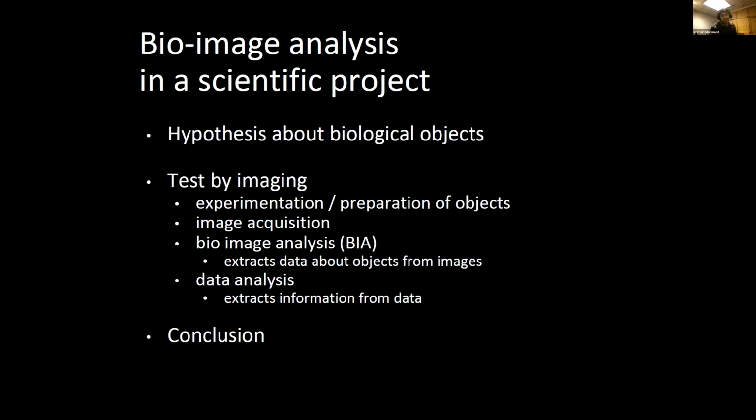Why do we care about reproducibility? First, let's look at what could be a timeline for a bioimage analysis project. You have some hypothesis you want to test about some biological objects. You will try to test this hypothesis using imaging.